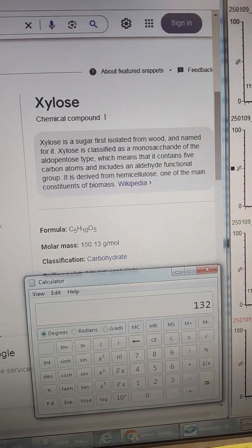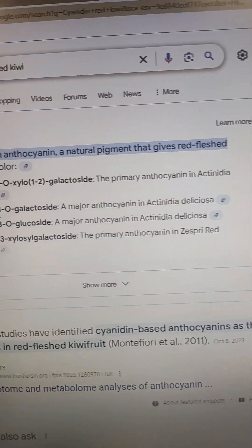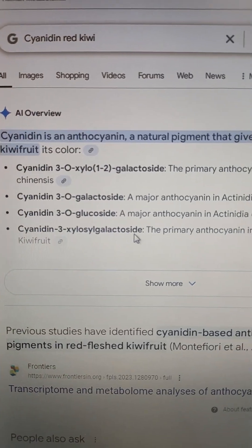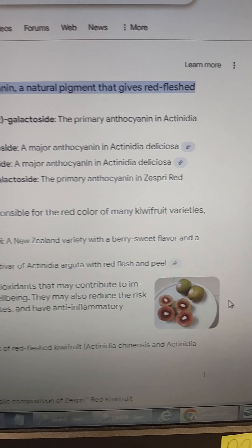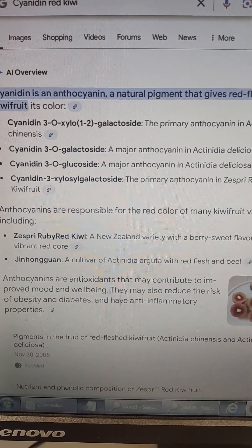So this is going to be cyanidin xylose galactoside. That is the pigment, I guess I could have just looked it up, in the red kiwi.